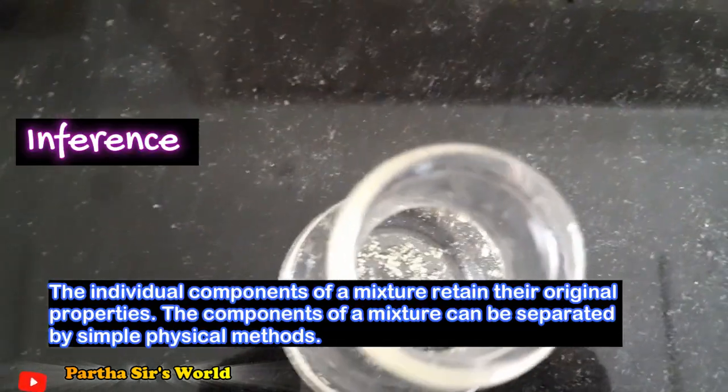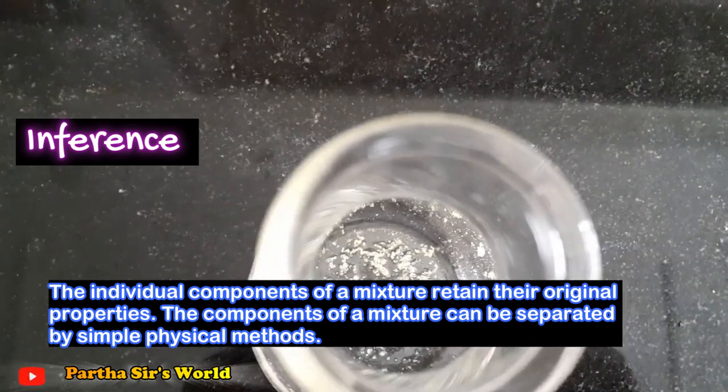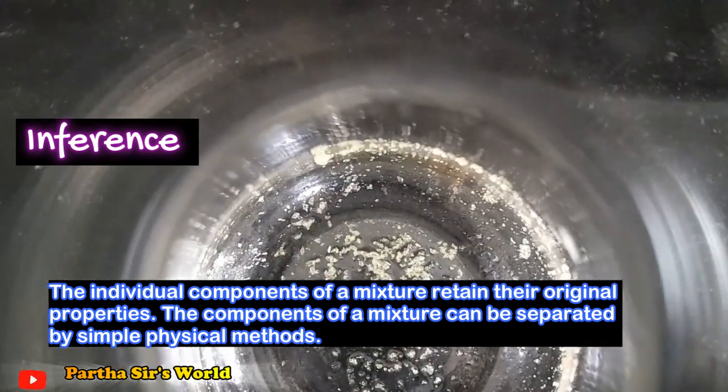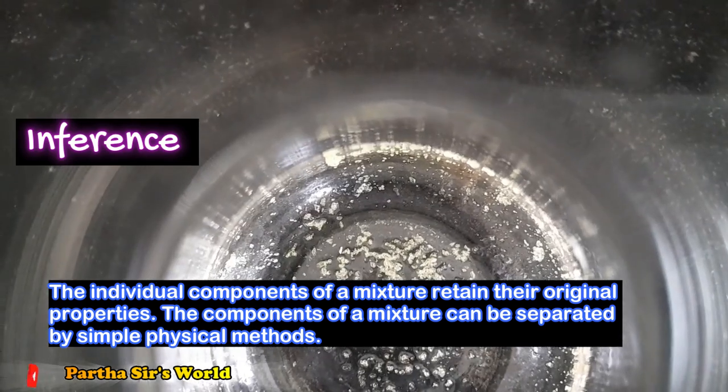Inference: the individual components of a mixture retain their original properties. The components of the mixture can be separated by simple physical methods.